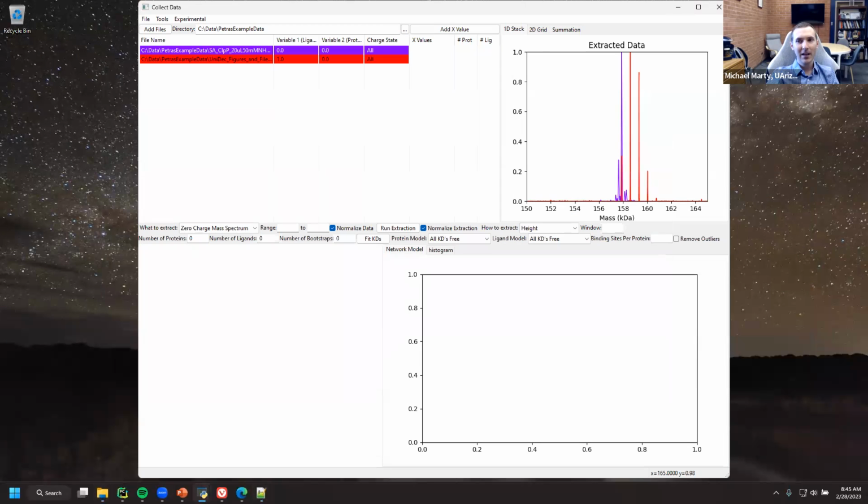It's kind of the whole ethos of UniDec, trying to put it all out there. We're not hiding any of your data. It's all there. And if you can't get to it, it's easy to just put in a print or a dump or something like that. It should all be there. Yeah, that's super cool.